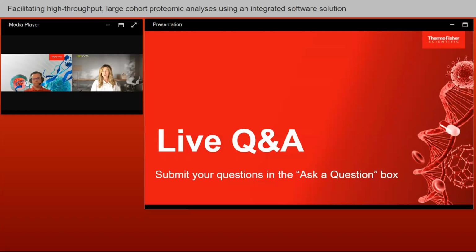Excellent. Next question. Are the protein and peptide counts displayed in the Data Explorer FDR filtered? Yeah, thanks for the question. So that's a question I think referring to the Ardia display of the Proteome Discoverer results. So the answer to that is yes.